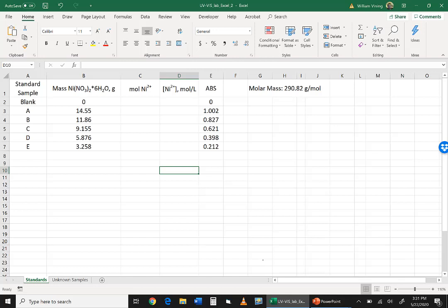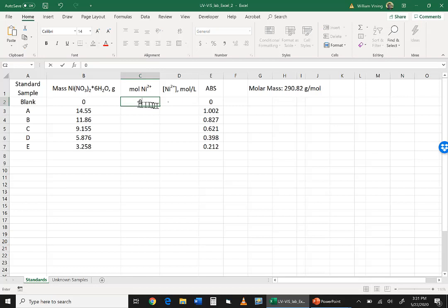So first of all, the blank has no nickel in it, so its moles of nickel are zero, and its concentration of nickel is zero.